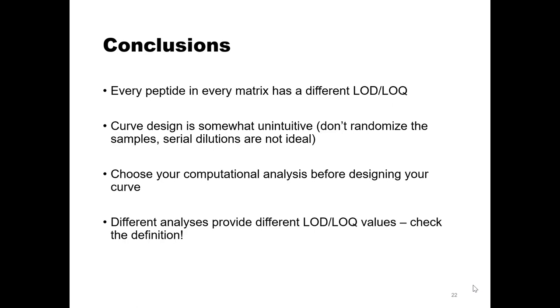It's a delicate balance though, because of the different levels, I'm going to be able to run a calibration for one day. Yeah. Right? Because the solvent calibrations of those things take long. But for the smaller molecule, I think it's more common because the flow rates are higher, it can do 5 minutes or 10 minutes. So I think, what are you comfortable with, and are you prepared for a while.